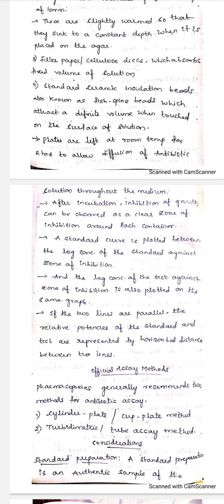Plates are left at room temperature for 2 hours to allow diffusion of the antibiotic solution throughout the medium. In the hole you have made, rectangular or circular, you pour the antibiotic solution. After pouring the antibiotic, you keep it for some time so that it moves from its place to the surrounding area. After incubation, inhibition of growth can be observed as a clear zone of inhibition. We have already learned about this.